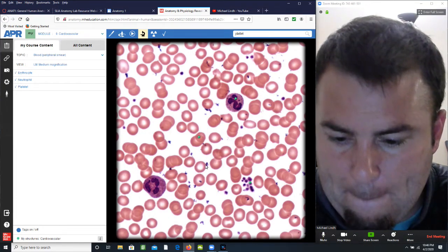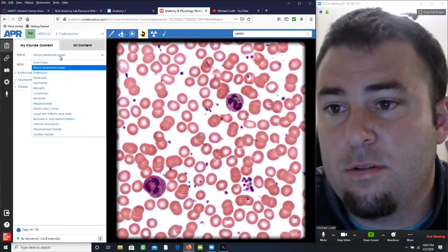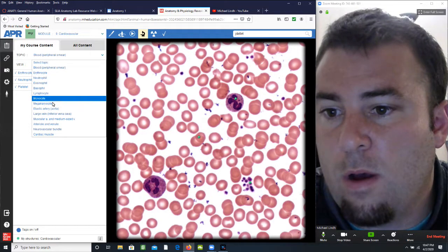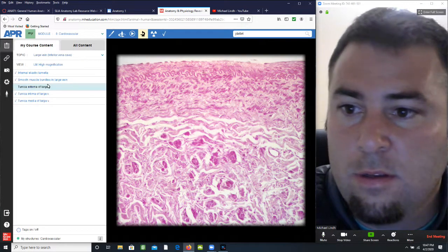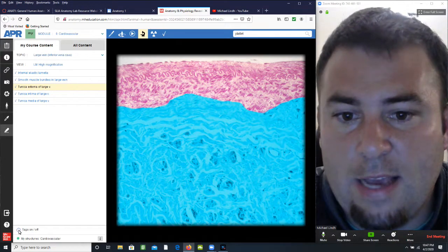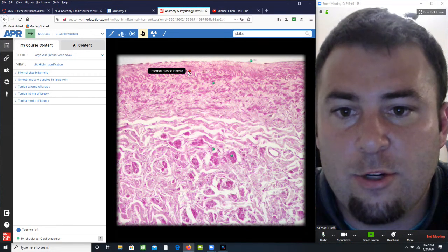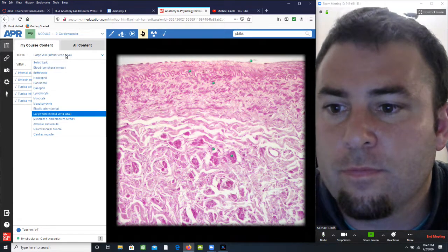All right. Now for blood vessels, we got to find all the tunics. So we're in blood right now, but we want large vein because that is a vessel. And look, it has some tunics for us. The tags on. Here's the tunica media, internal elastic lamella, tunica intima.